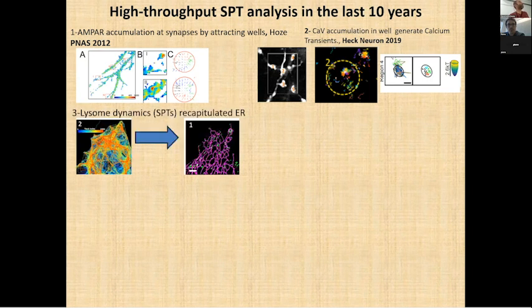By looking at trajectories of lysosomes, so if you went yesterday to the lecture of Lippincott-Schwartz, you can get from this lysosome, this is how we discovered that they are following the ER so well, because when we found this, it has to do with some kind of network structure. And it led to a study where indeed we show that this is very highly correlated.